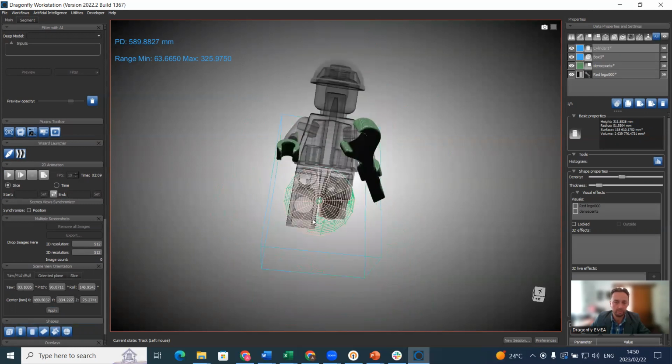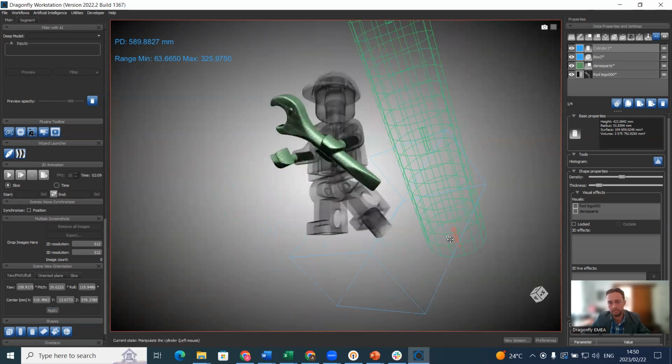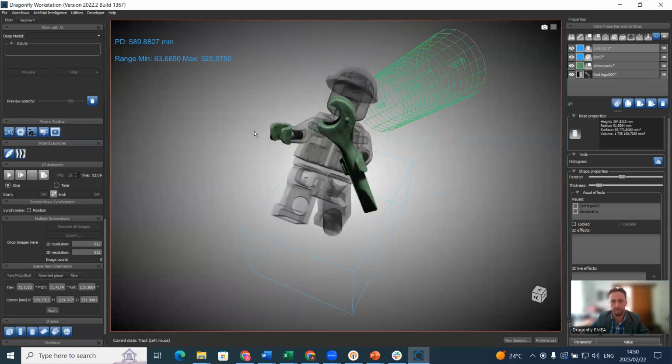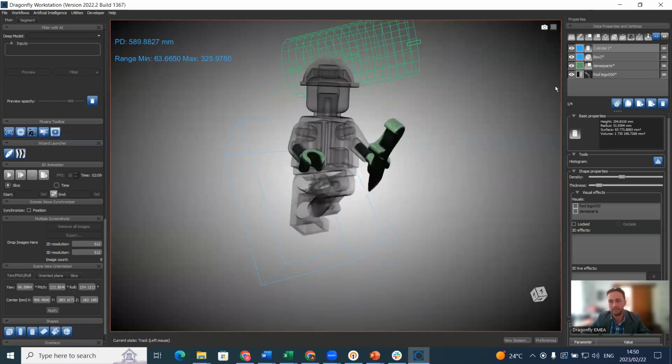Let's make a cylinder shape. It's maybe not the easiest thing for a demo if I've never done it before. Okay, let's forget about the cylinder. It's a bit difficult in 3D here.